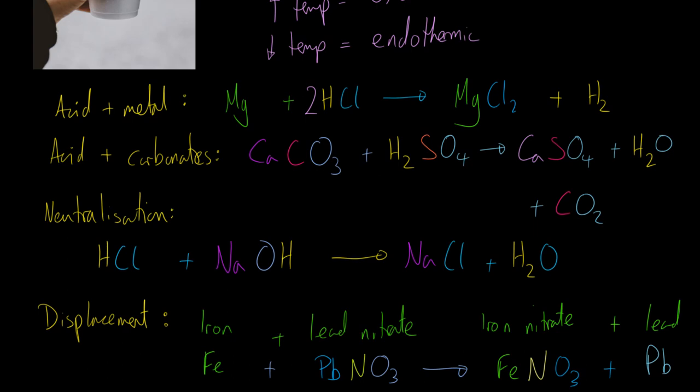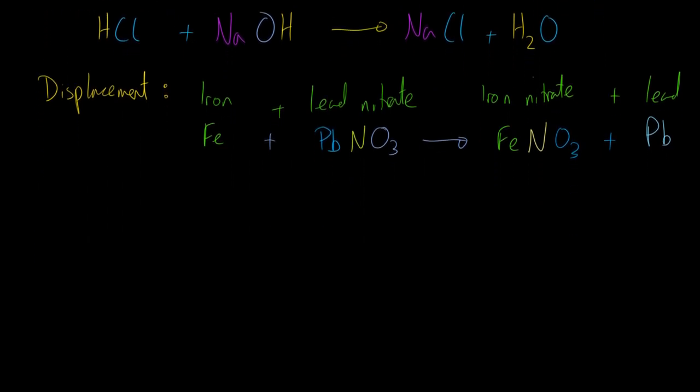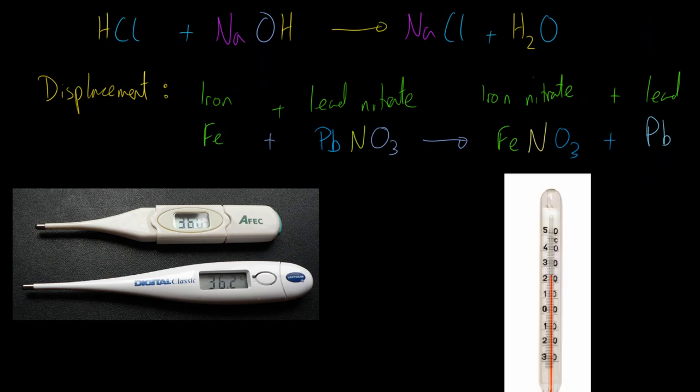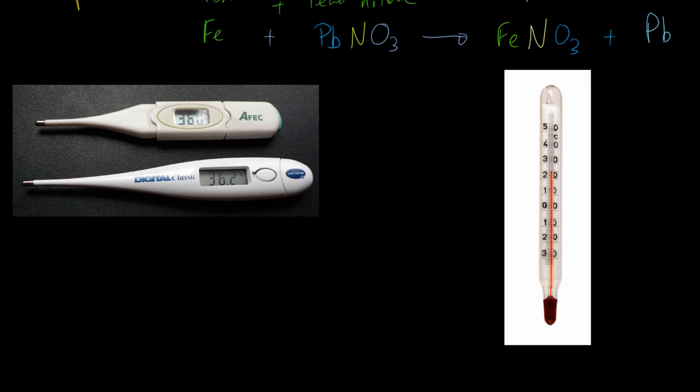It's possible that you may talk about equipment. So you may be given a choice between a glass thermometer or a digital thermometer like so.